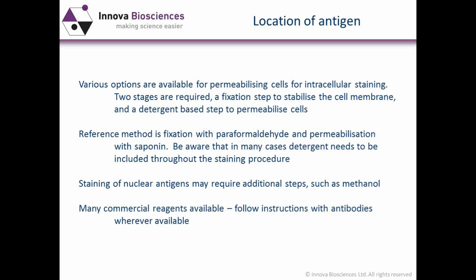Staining of nuclear antigens might require additional steps, such as further methanol treatment. In many cases these days, people are using a whole range of different commercial reagents for permeabilization. And my recommendation there would be to follow the instructions that come with the antibodies that you're using wherever they're available.